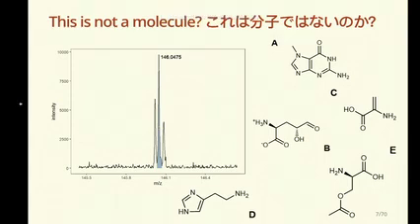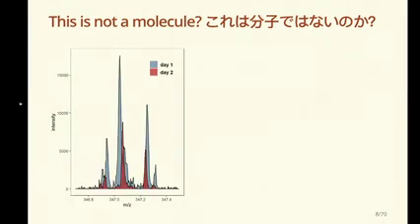Okay. Thank you. Okay, so we had some options, but still very difficult to see. If we look a bit at how this data looks like, if you see these two mass spectra acquired on a different day, it's quite easy to correspond to the different features. The peak shapes are still quite okay, so we could easily say that the mass peaks correspond between days and we can link them and correspond them together.